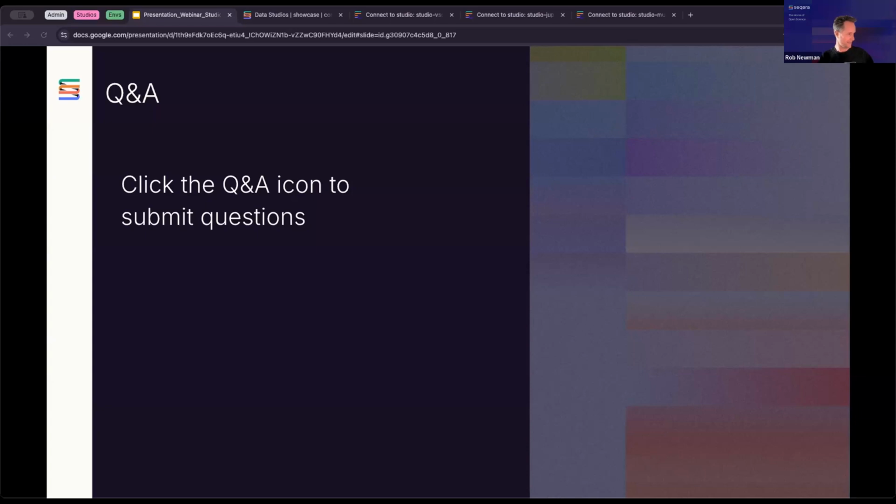Is Seqera Studios another name for Seqera Platform? No, Seqera Studios is a feature of the Seqera Platform. So it's part of the platform. The platform is where you can run pipelines and explore data. Studios is an additional feature that's part of Seqera Platform.